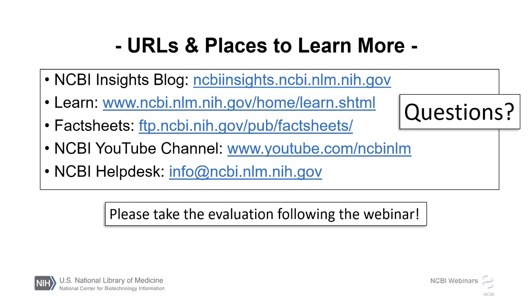Sure, there are actually a whole bunch of questions. The first thing we'd like to talk about initially are the databases, the targeted loci database. There's a number of questions about what types of sequences are actually located in that particular database. One of the people on the webinar was mentioning how there are many databases out there that have different levels of quality of sequences. And what exactly goes into these targeted loci databases?